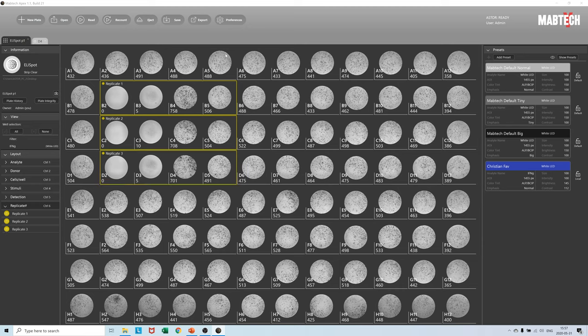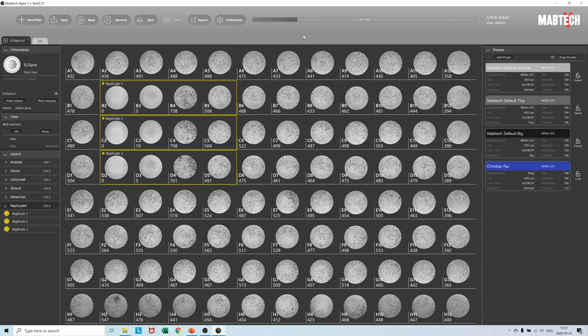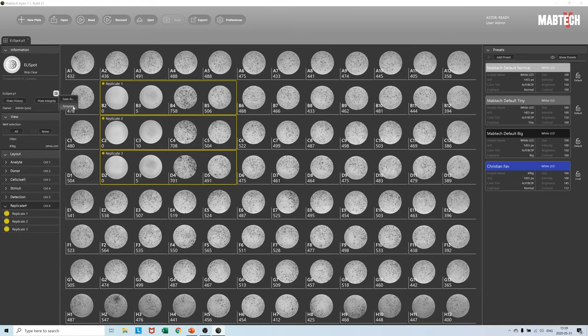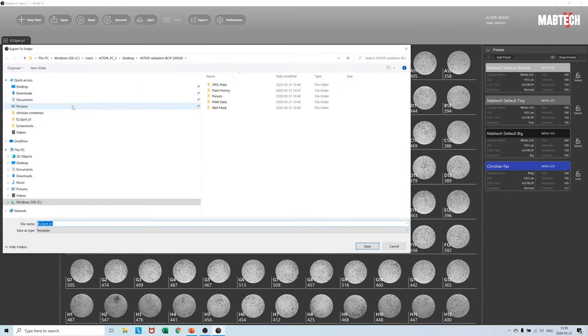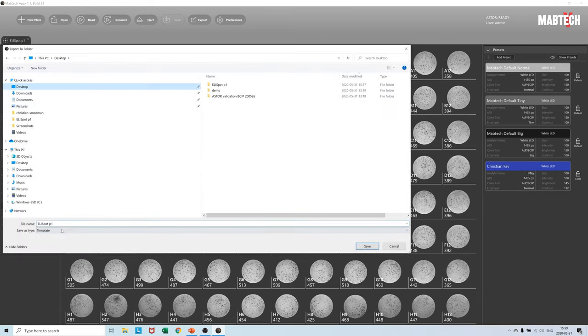We resave the plate and a layout subfolder has been generated inside of the plate folder. With the first plate analyzed, labeled, and saved, we can now create a plate template by pressing here under the information section. Apex prompts us to name and save the small little template file anywhere we want on the desktop. Let us name it template Elispot.